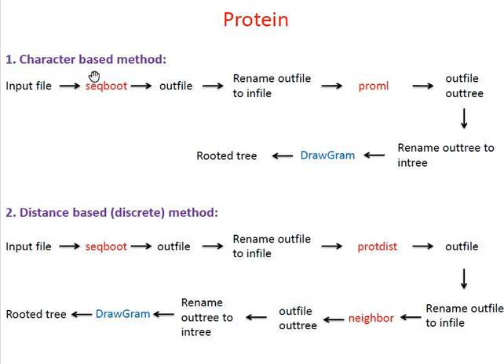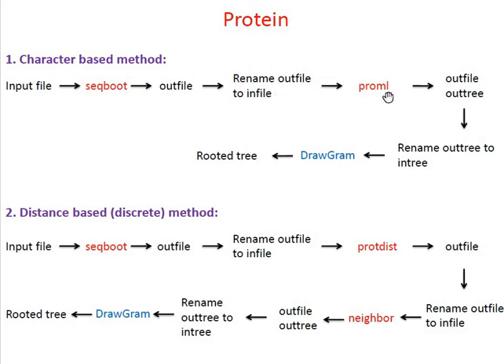There are similar steps followed for a protein sequence. In this case you have different programs: you'll use SeqBoot and ProML programs under the character-based method. The input file in text form or PHYLIP input file format is given to SeqBoot, which gives you an outfile. Rename this outfile as 'infile,' and this infile is taken by ProML, which gives you outfile and outtree. Rename the outtree as 'intree,' give it to DrawGram, and you'll obtain a rooted tree.